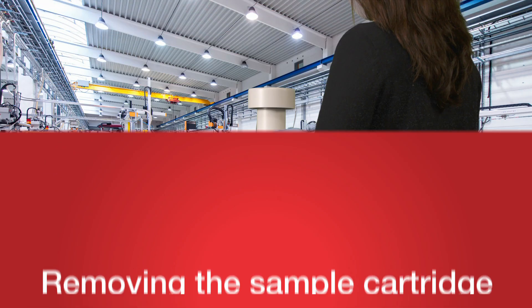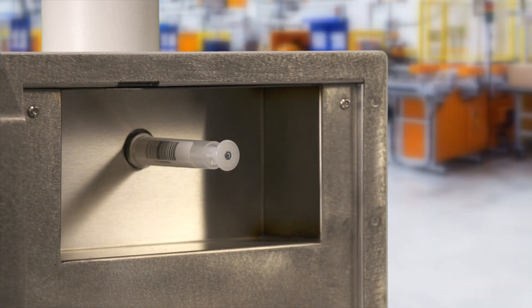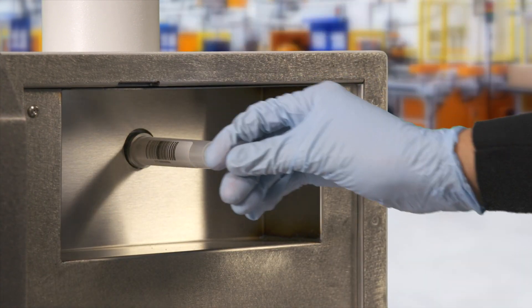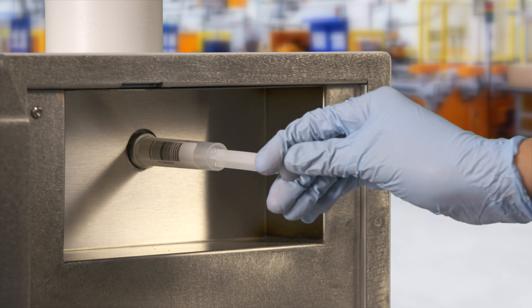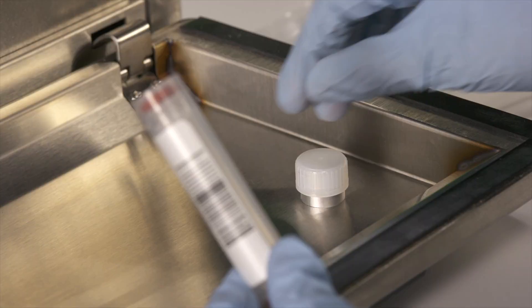Once the sampling time has elapsed, open the front door with the included key. Pull the plunger all the way out. Turn the sample cartridge counterclockwise until it disengages.